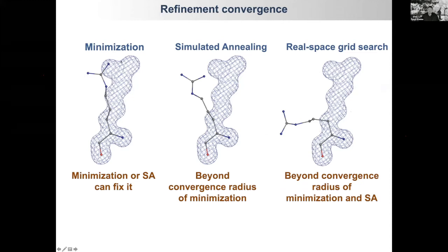So that's the illustration of different optimization methods that we routinely use in refinement. Sometimes we use them automatically, sometimes we rely on users to choose them, but these are your choices, and this is what really is behind the scenes.